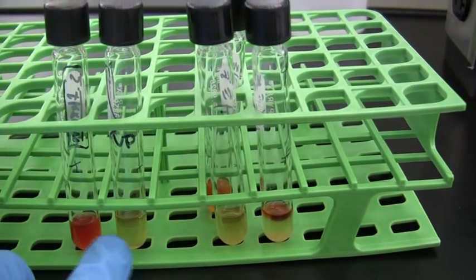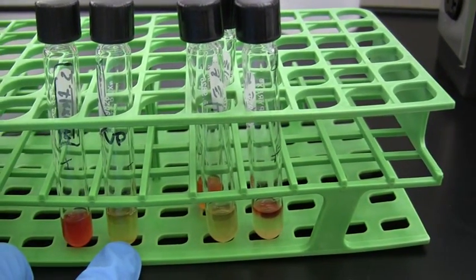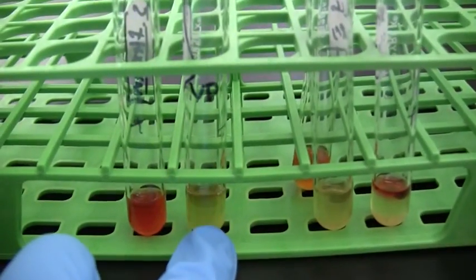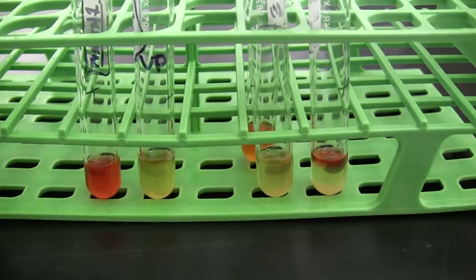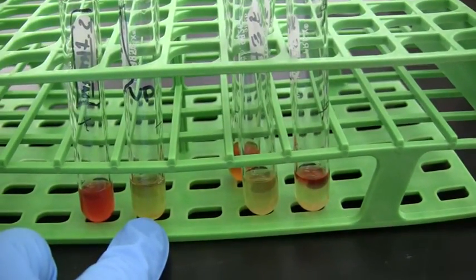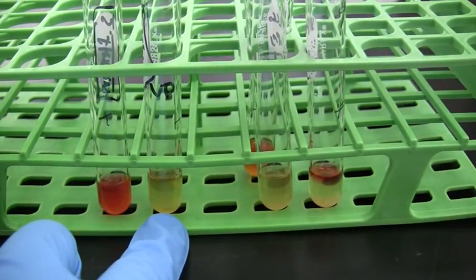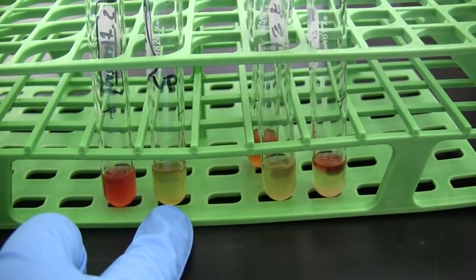Now we did the exact same incubation here with the same organism. We just simply added a different reagent at the end of the incubation period. I'm going to zoom in here just a little bit. And here we added the VP reagent. The Voges-Proskauer reagent is a combination of two reagents, and it's somewhere around 8 drops of A to 4 drops of B, but that can vary, so always check with your instructor on that.